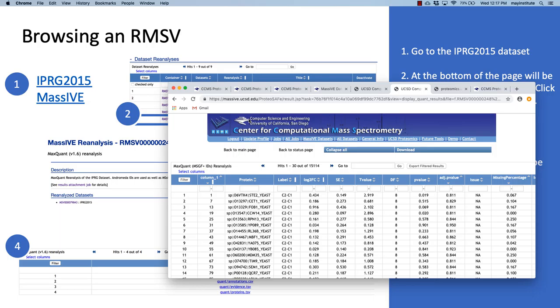The only way that the headers are used is that you expect that the first part after the caret is just going to be the identifier for the protein, and then is followed by whatever text, which is a description of the name of the protein or whatever other information you'd like to have in there. But it doesn't try to parse it beyond that.